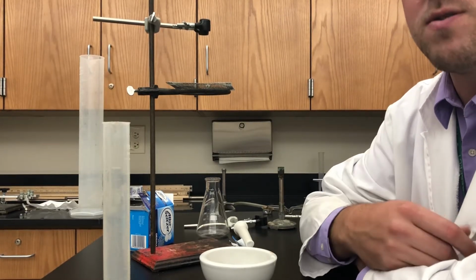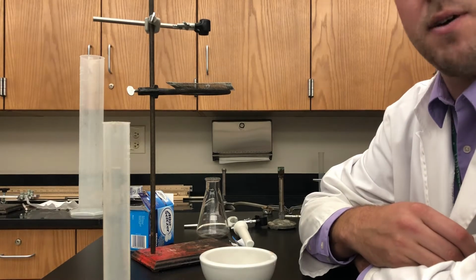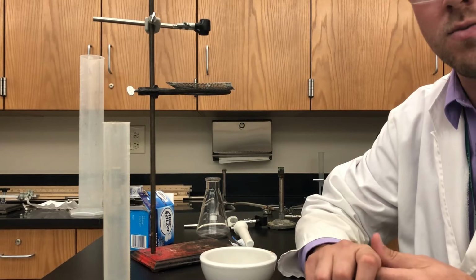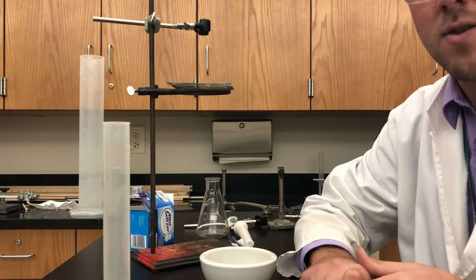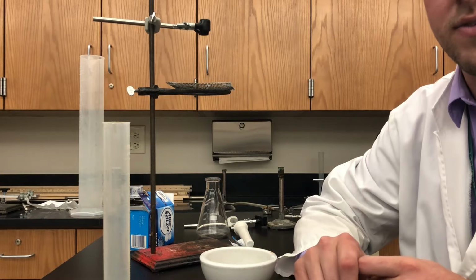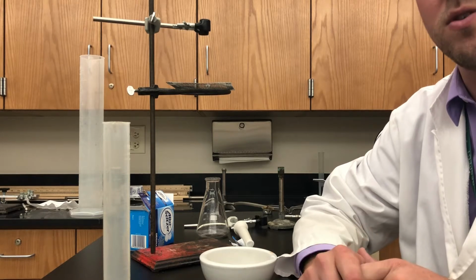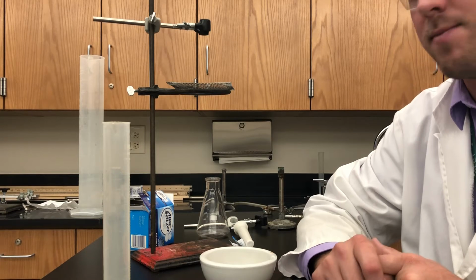That's number one. And then number two, the big overarching purpose of this lab is to talk about experimental design. So independent, dependent, and control variables. I'm not going to tell you what the control variables really are. I want you to watch out as you're doing this lab and jot down and think about what are some of the things that you want to keep consistent throughout the entire experiment. What are the things that, if you weren't very careful to control and do the same, would give you bad results? There's a couple big ones, and we'll see if you can find them as you go along.